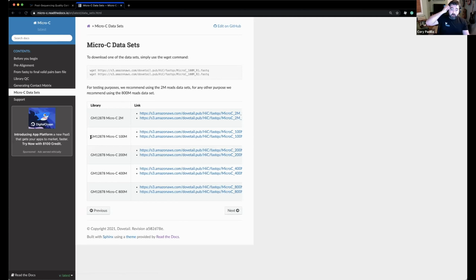The other thing I would like to point out here is we have data sets available for you all to just download and play with and test. We have a very shallow sequence data set at 2 million read pairs. So if you just want to check to make sure the install for all the tools works and you can get through the pipeline in a really short amount of time, start here, make sure everything's working.